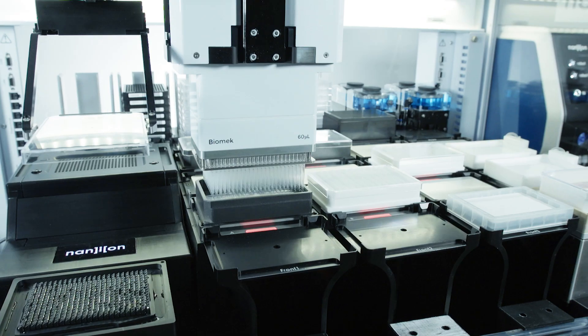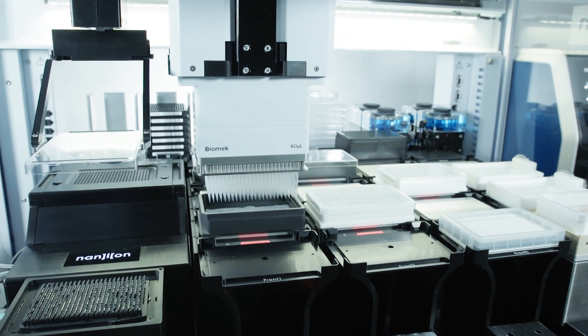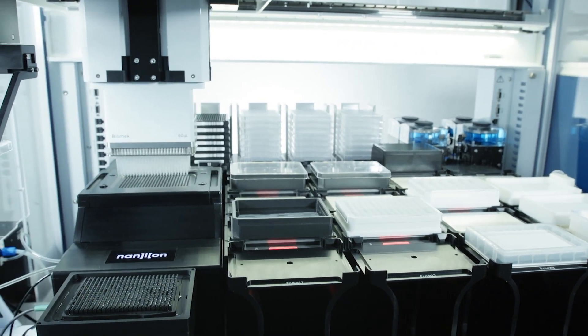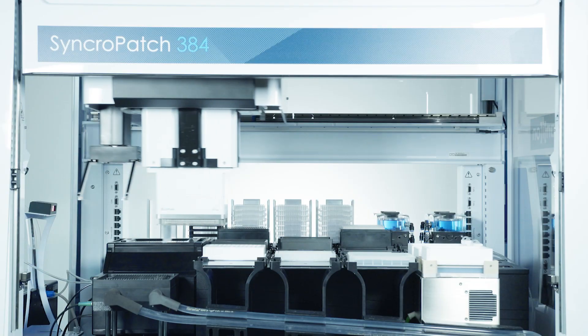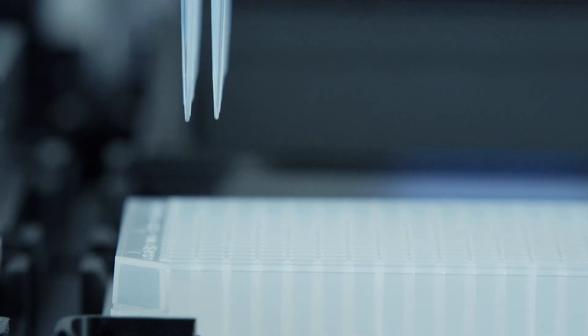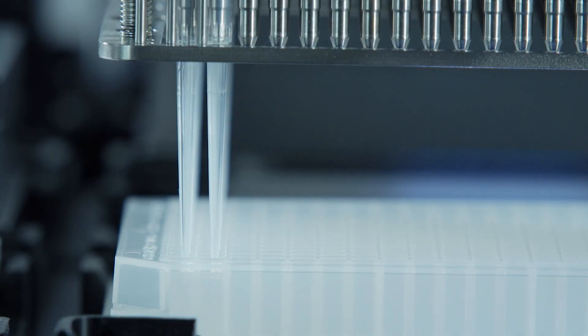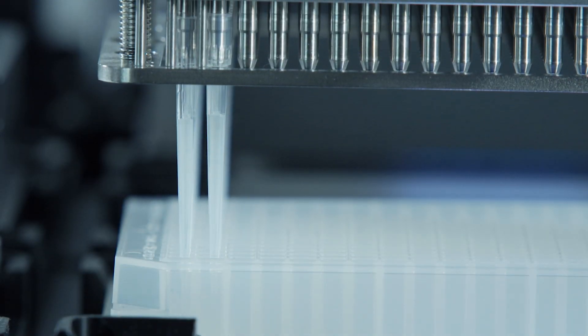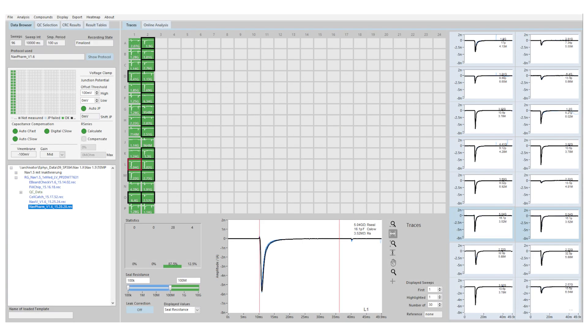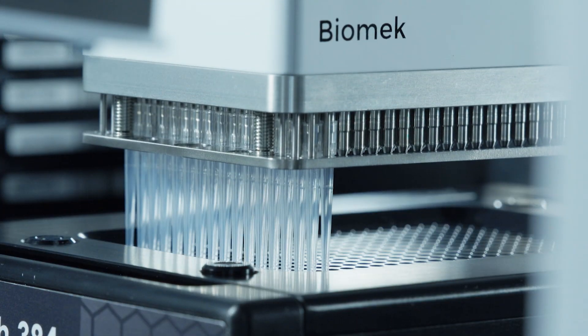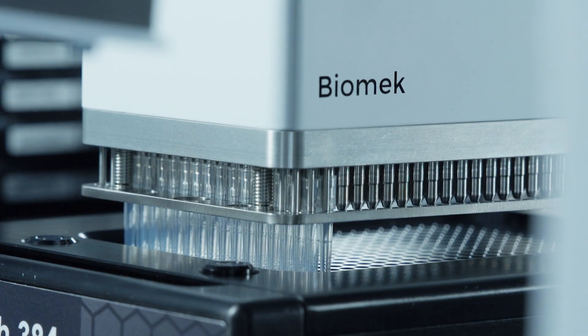The new Syncopatch 384 can be seamlessly integrated into standard HTS environments and the throughput adapted for your needs, from 32 well mode for assay development and small screens, right through to 384 well unattended mode for large compound screens.